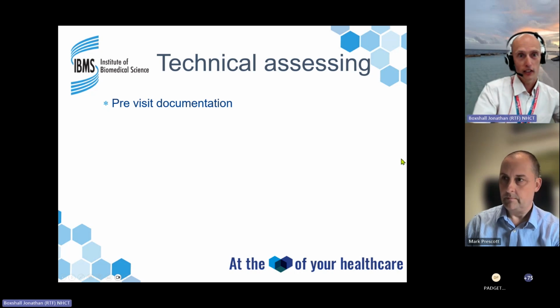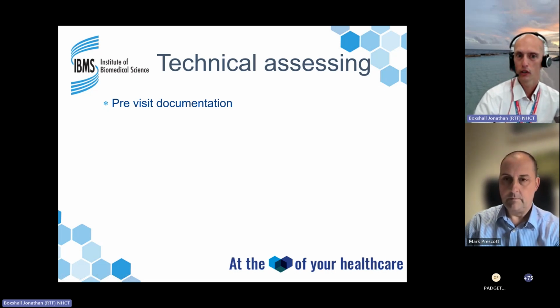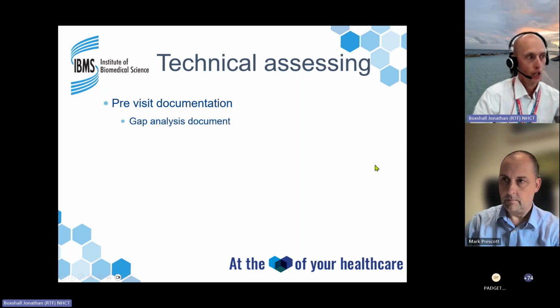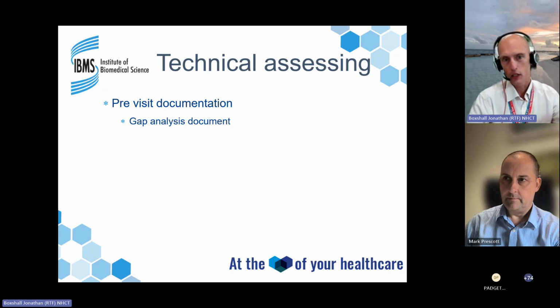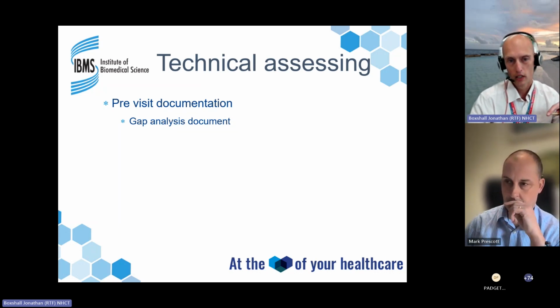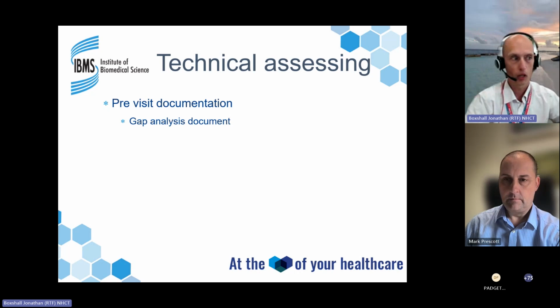So just to give you an aspect from my side, when we're doing the technical assessment, we're getting the pre-visit documentation like we always used to, like the SOPs, etc. But we're also now getting the gap analysis document. As Mark said, the assessment managers normally looked at this, gone through your gap analysis, highlighted things that they may need to look at, highlighted things that we as technical assessors may need to address, and said, right, Jonathan, can you on this assessment make sure you look at this bit here, because we just need to make sure they're compliant with the standard.